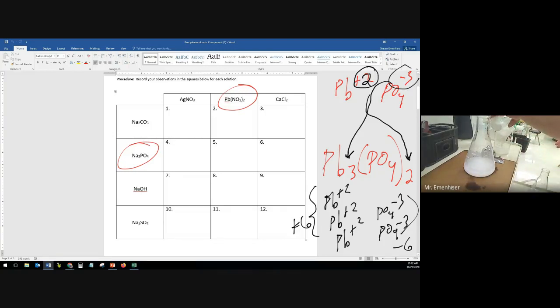Add some more. There we go. Now let's get some more water in here and get all this solid. All right. I'm going to let that settle out. Hopefully we'll get some solid. That's number 5. Okay, I'll get my papers ready again.